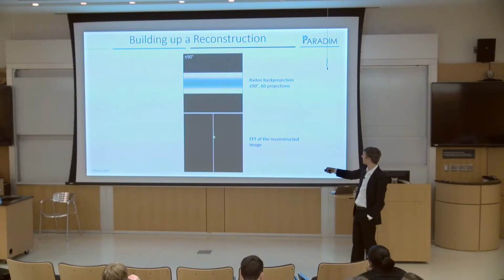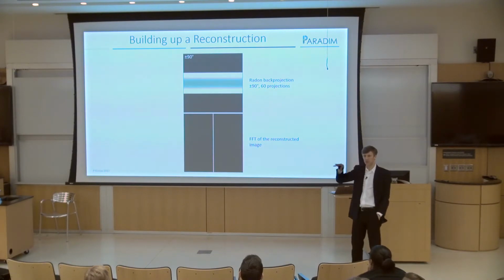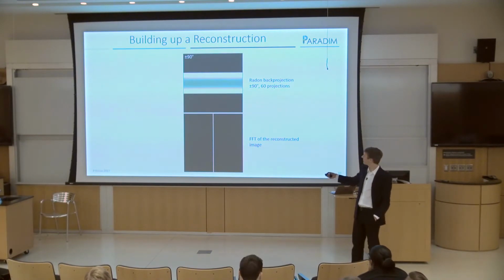This is actually the Fourier transform that I'm going to show you. This is a movie that we'll see run. This is the 3-dimensional reconstruction of our object as I add different projections in, and you're going to see equivalently the Fourier space representation of that, both together.